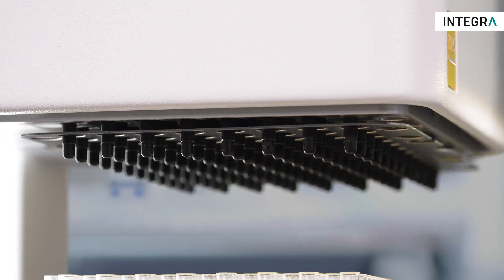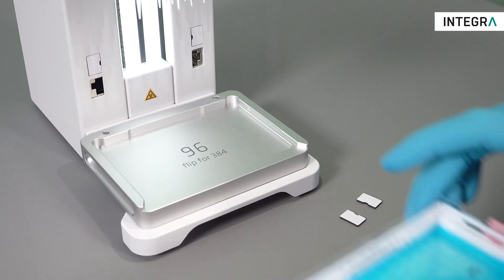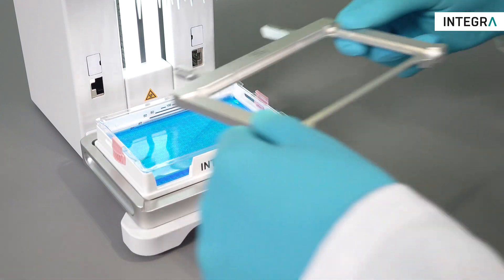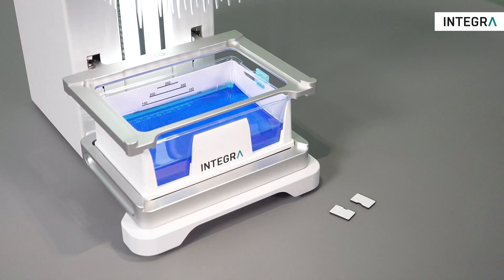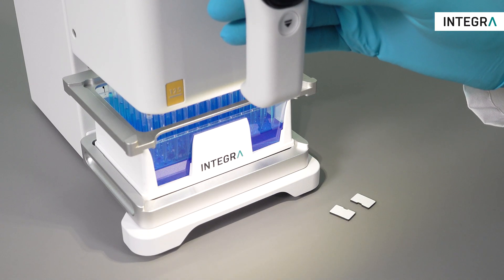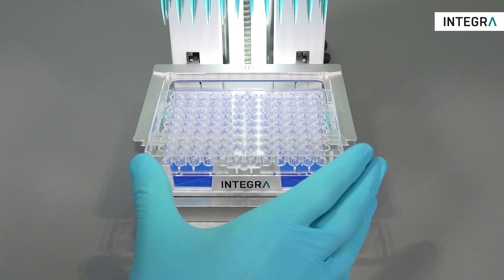To work with the second stage, simply remove the magnetic covers and install it at the desired height. The heights are perfect for Integra's 300 and 150 ml automation-friendly reservoirs. With your source on the base stage, simply aspirate through the second stage and slide the target plates from left, right, or front.